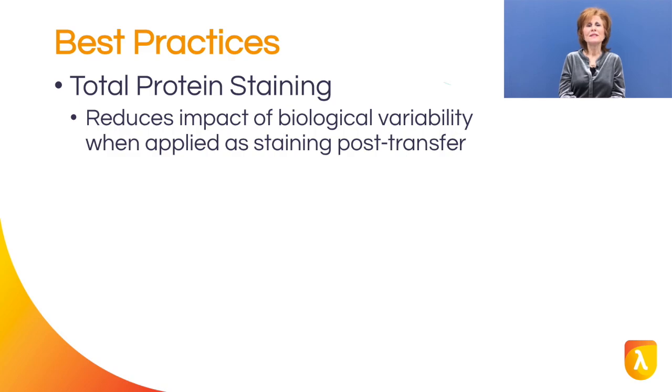Overall, normalization by total protein staining is a very relevant loading control that reduces the impact of biological variability, especially when applied as staining of membranes after transfer.